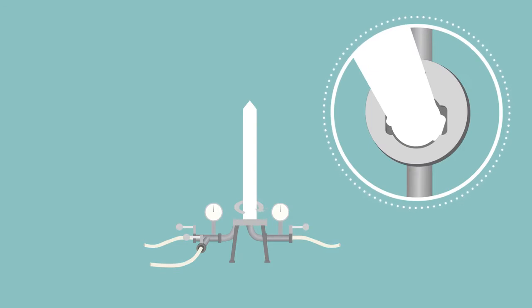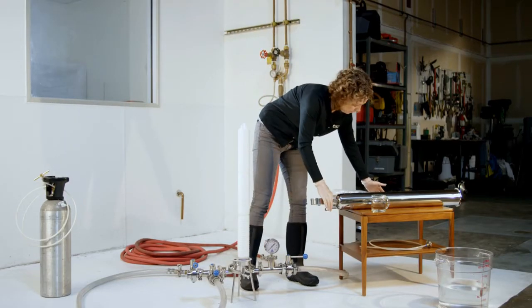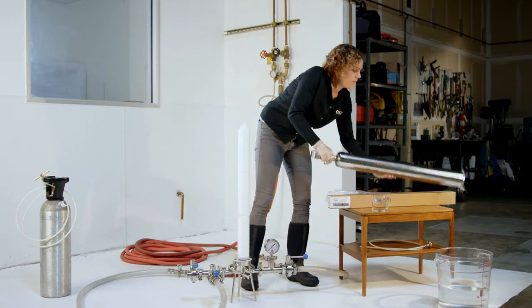Then, twist a quarter turn clockwise until the Code 7 locking tabs are firmly seated into the adapter cup. Code 8 and Code 3 cartridges do not need to lock into twist position.